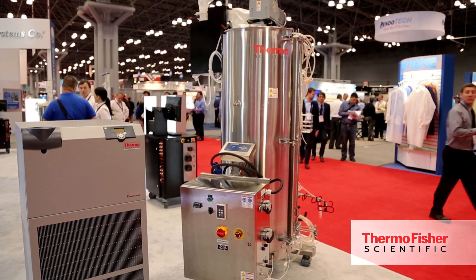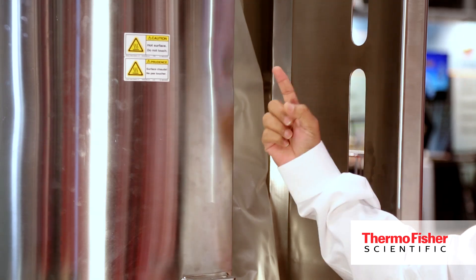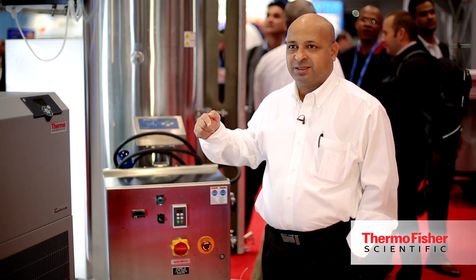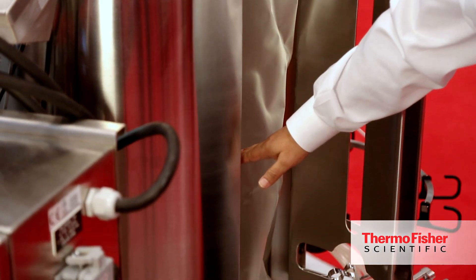This needs a lot of vigorous mixing and a lot of oxygen. We have some very specific features that will help in growing the cells. We have a different kind of agitation system here with Rushton turbine impellers — there are three impellers — and then we have a disc sparger at the bottom, a drilled-hole sparger, which gives a lot of air and hence oxygen to the cells.